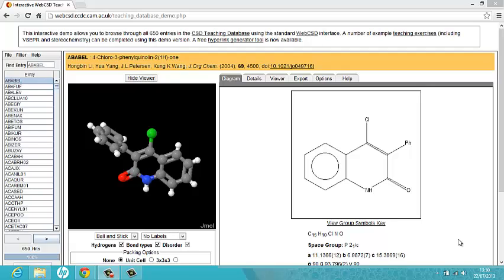Hello, in this video I'm going to give you a general overview of the WebCSD teaching subset. The WebCSD teaching subset contains 650 real crystal structures as of summer 2013 that has been designed to be used as an aid for teaching using the 3D crystal structures provided. The WebCSD teaching subset is a smaller version of the WebCSD system, which has over 800,000 crystal structures.